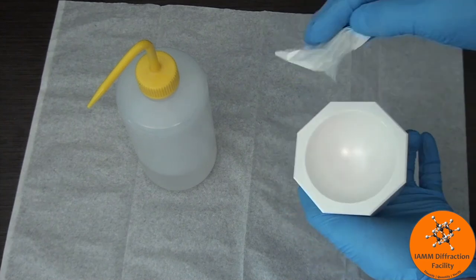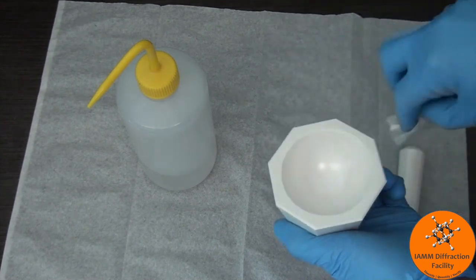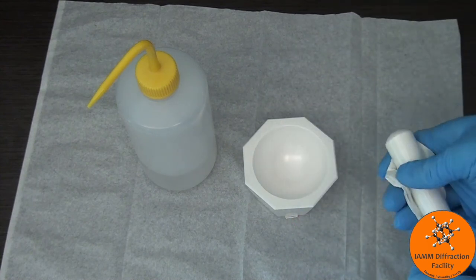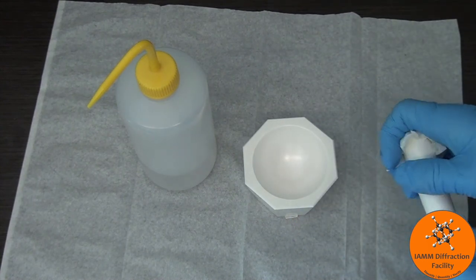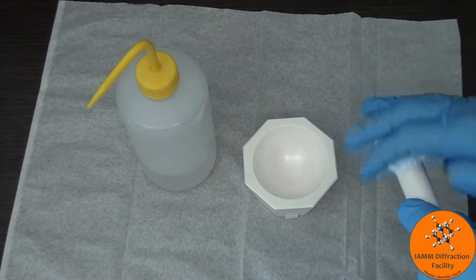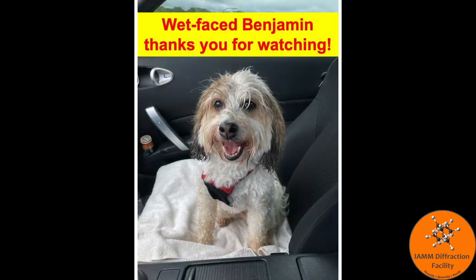And then normally what I would do is take this to, if you have a source of compressed air or compressed gas, just take it over to that and blow it out just to make sure that any sand that might be still sticking to it gets blown off.